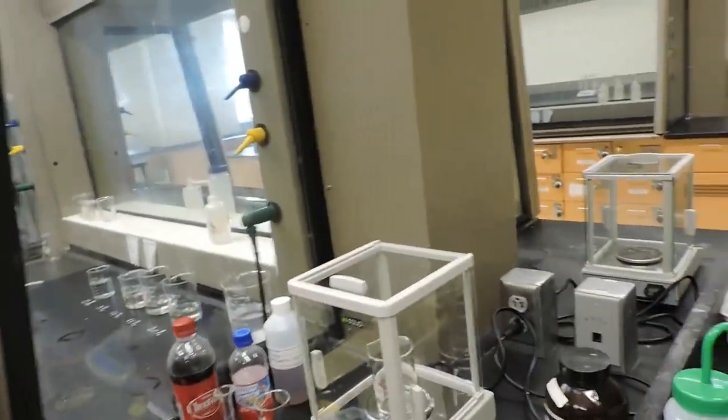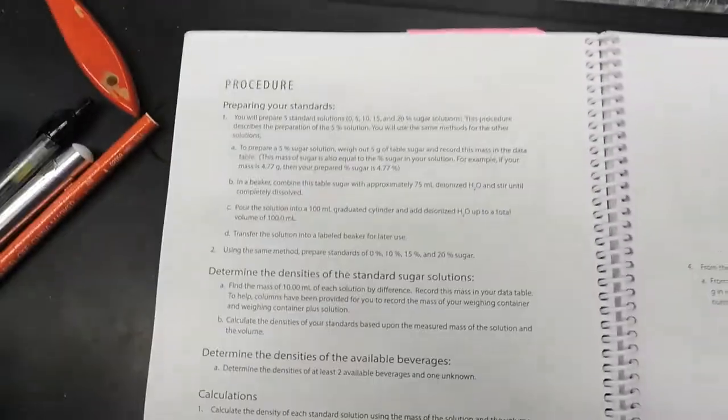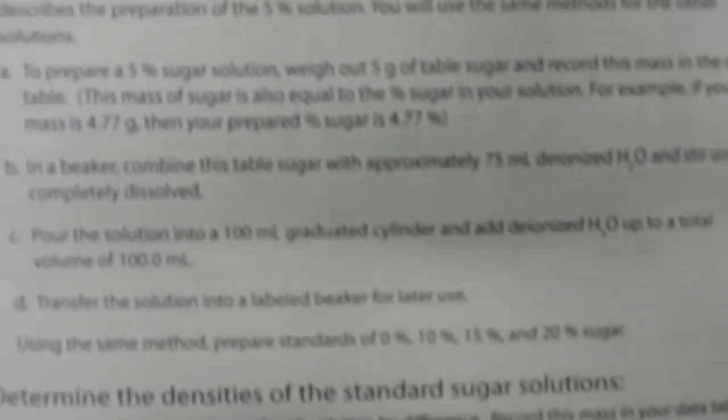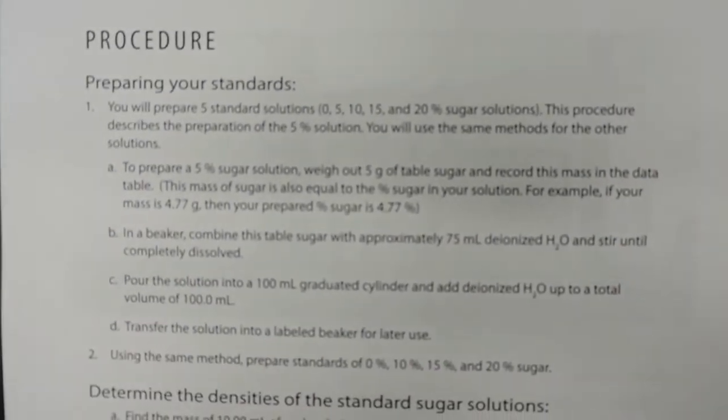The very first thing we're going to do is prepare some standards. We have five standard solutions that we're going to make: 0%, 5%, 10%, 15%, and 20% sugar solution.